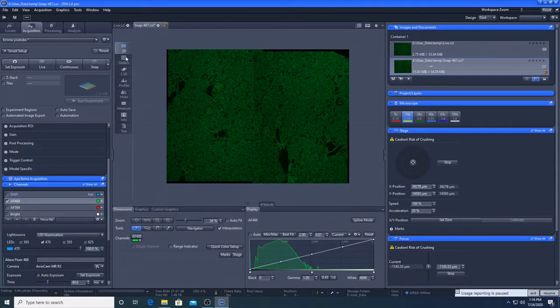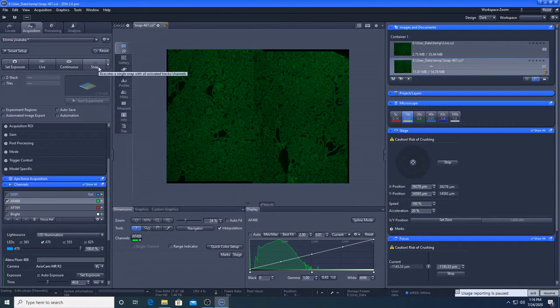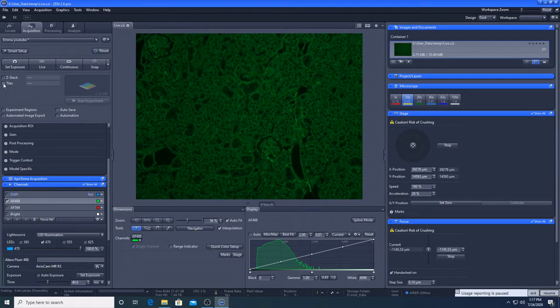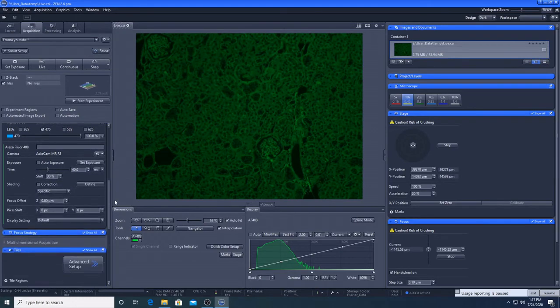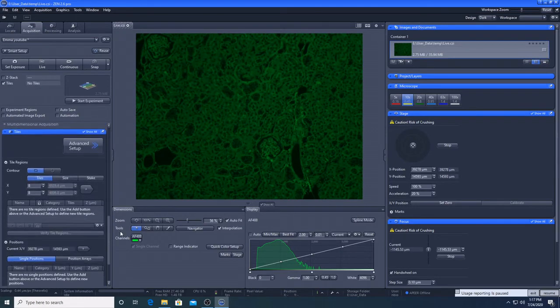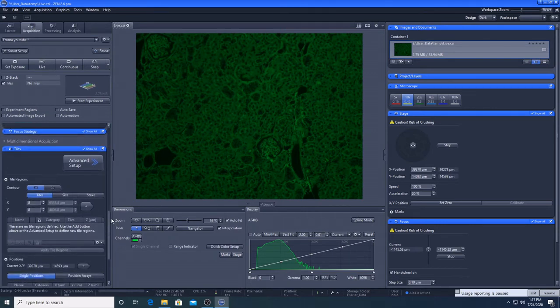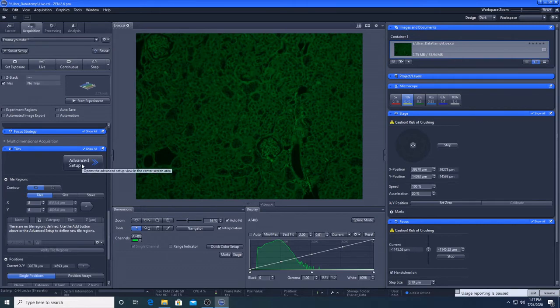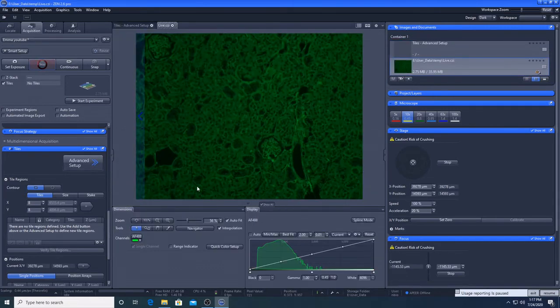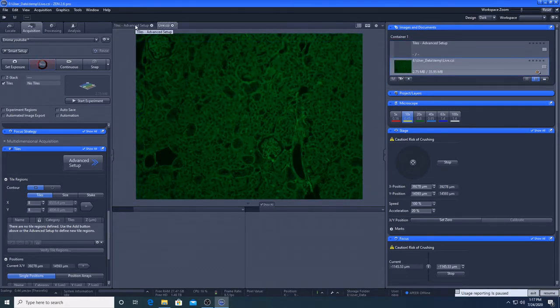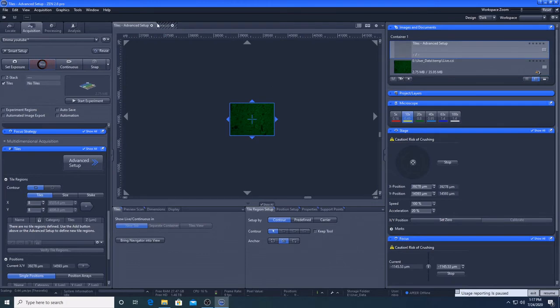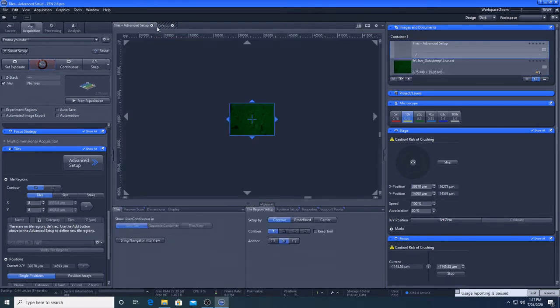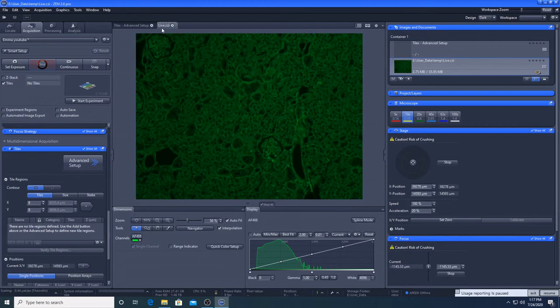So that's just very simple tiling. Now we're going to use the tiling menu. So I'm going to click tiles. If I scroll down, we have a new menu here, which gives us a lot more control over where we're going to tile. So I'm going to go to advanced setup. And we now have another menu here. So we've still got our live window, but we've got advanced setup over here. So I'm going to stay on the live menu for now.